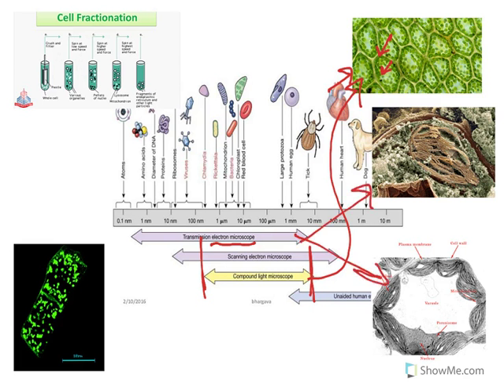As you can see, the detail is a lot different between the light microscopy and the electron microscopy. With the electron microscopy, if you look here, this is a chloroplast, and you can start seeing the inner membranes. Here's the vacuole. So you can start seeing some of these structures that we talk about in our books.